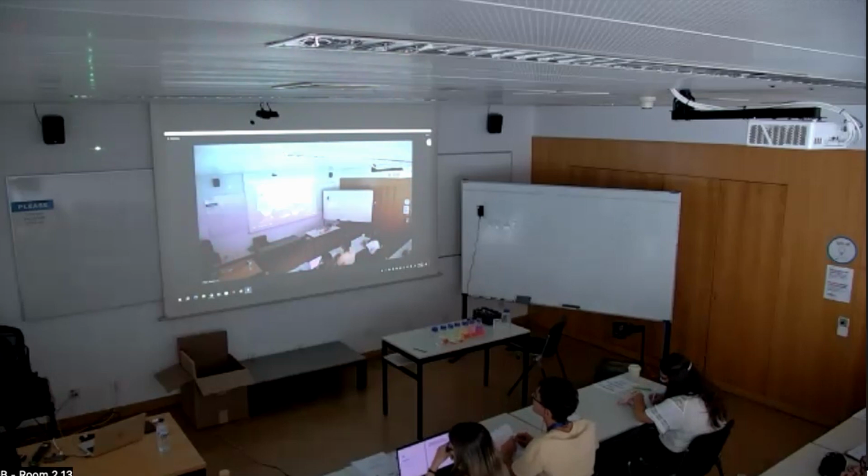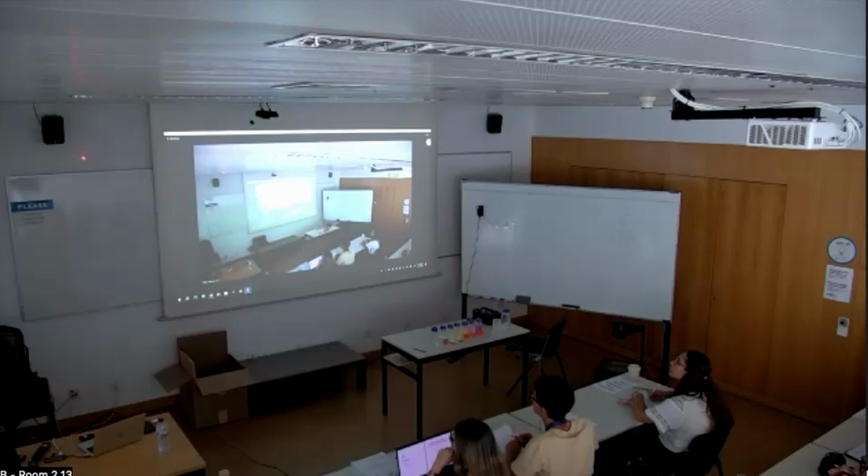So look at the distance between the bright spots in the diffraction pattern. Okay, and look at the distance here. Is this larger or smaller than the one that we had before? And then for those of you that have very good eyes, we can try with the blue light.